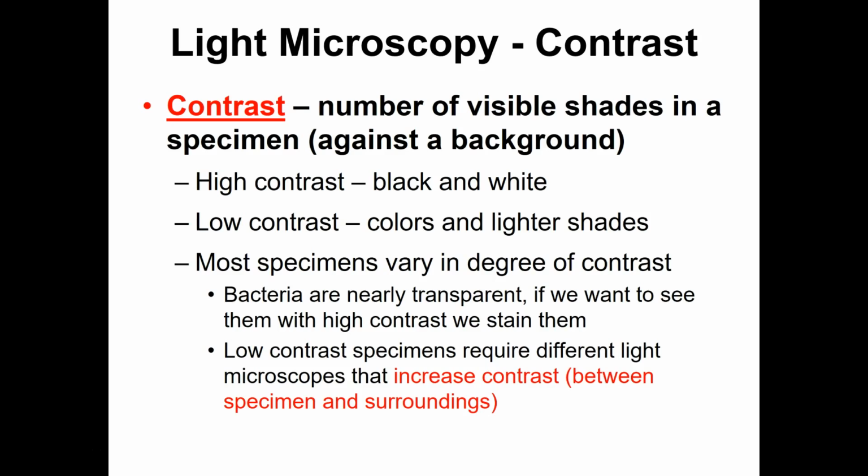All right, so one other concept to address for what microscopes do for you: contrast. Contrast is the number of visible shades in a specimen against a background. That means, can you see an object against a background? That's simply what it is.